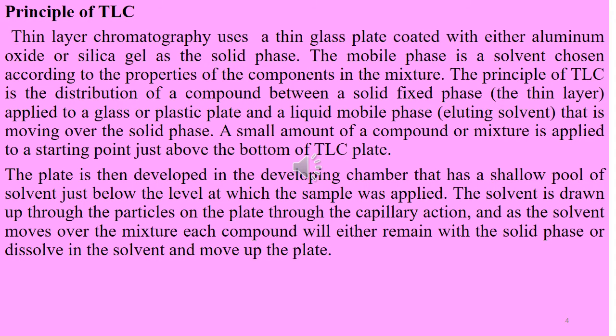Principle of TLC. In chromatography, 2 types of principles are involved, namely partition and adsorption. Here we will discuss both types of principles. First one is partition. The separation of the components from the sample mixture is carried out by the process of partition of the components between 2 phases.